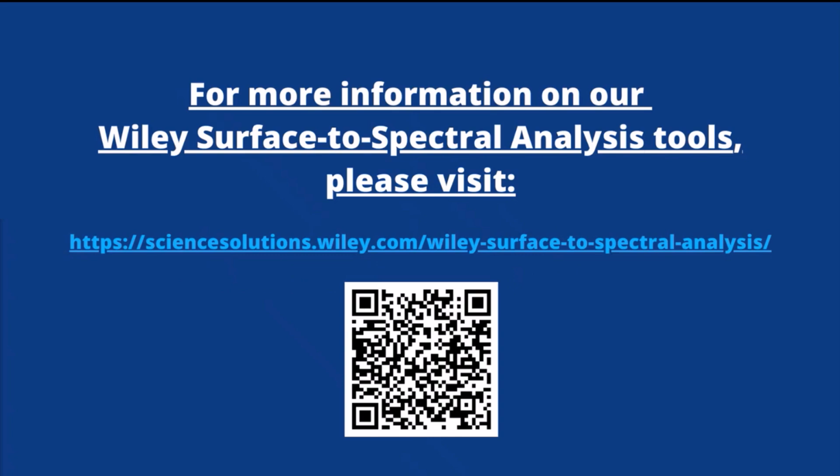Are you planning to include the Raman Renishaw file format as one of the supported versions? It's already supported by KnowItAll. Yeah, on our website at sciencesolutions.wiley.com, if you look for the tab for this surface-to-spectral analysis software, you can find a list of all the supported file types. It's quite an extensive list. I can't list all of them off the top of my head, so I'd recommend looking there. Great, thank you both.